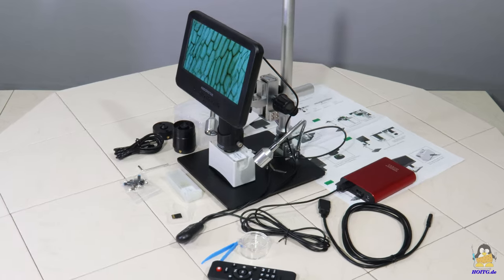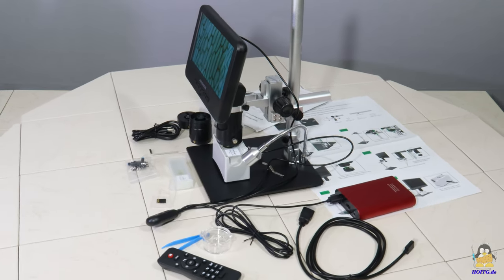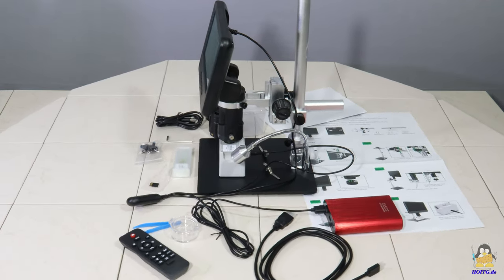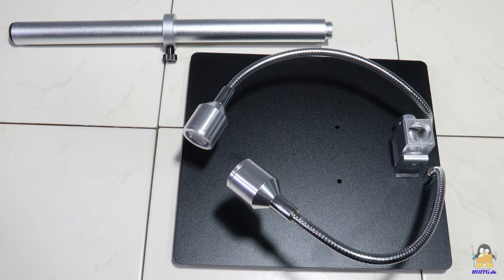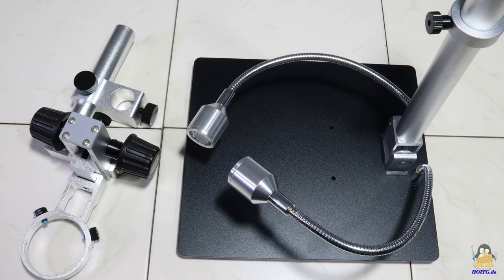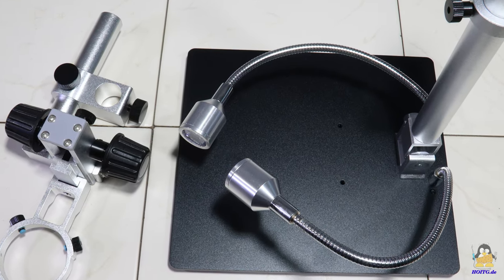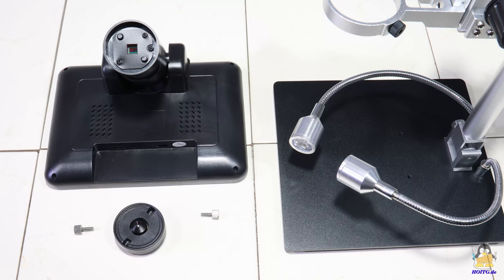As always, high resolution photos of all parts can be found on the website of HowOpenIsThisGadget. The assembly of the microscope is done quickly, only a few parts have to be mounted and all steps are well illustrated in the manual.